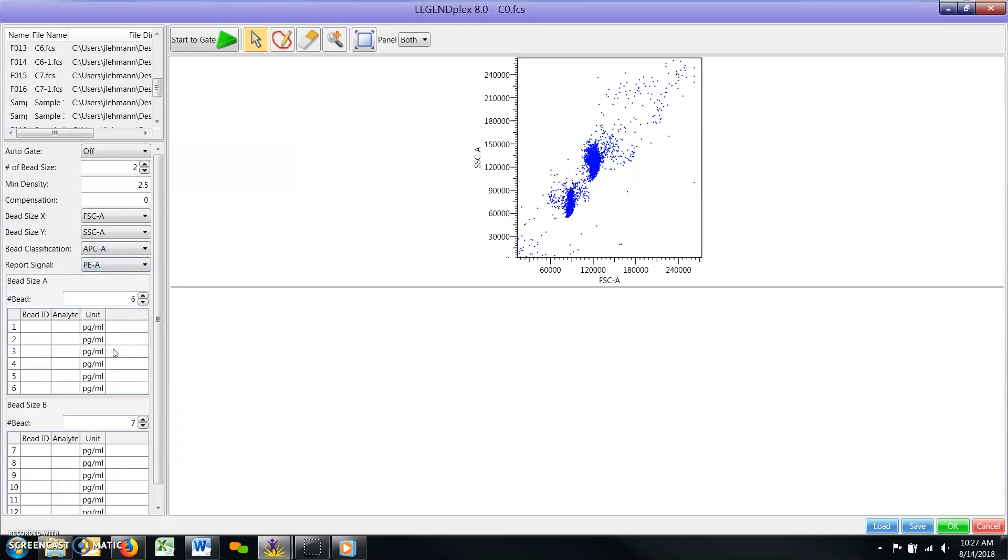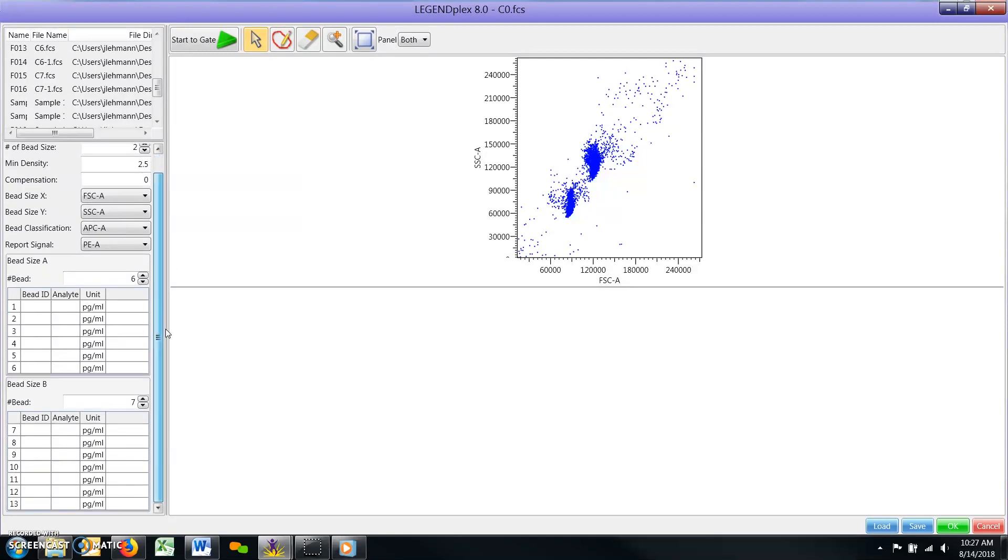Bead IDs. Below the parameter definitions, you will define the fields to define bead IDs and their associated analyte targets from your assay. Please locate this information in your assay manual.